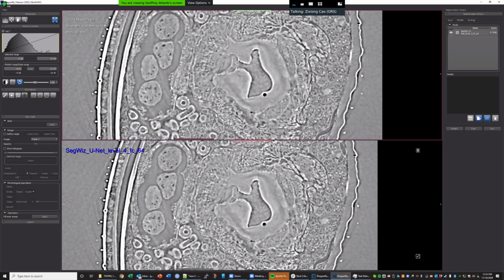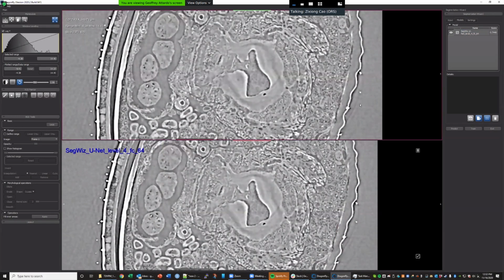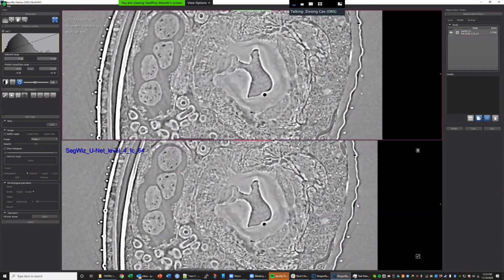Okay. Yeah, keep trying with the wizard. I think it's because we haven't tried out any other options like the multi-slice option. Multi-slice unet is a very good one to use. The 3D unet is, as I said, very slow. It's not the best one to start with, but multi-slice is very good. Okay, I'll try it.